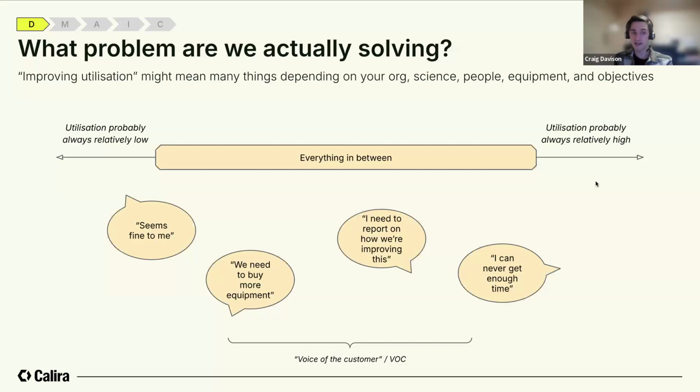What I will say is that our data and independent reports in R&D suggest that this middle ground we're talking about has significantly lower levels of utilization than people expect or want in their labs. And for you watching, that represents an area where you can have a huge impact for your organization by putting in procedures, policies, solutions in place that can improve that over time.